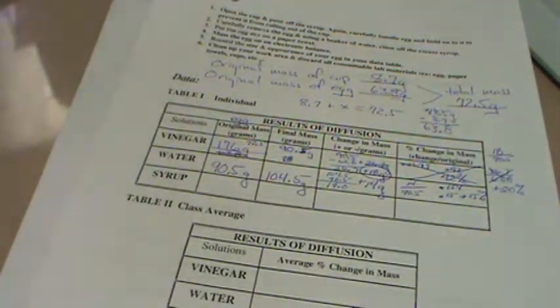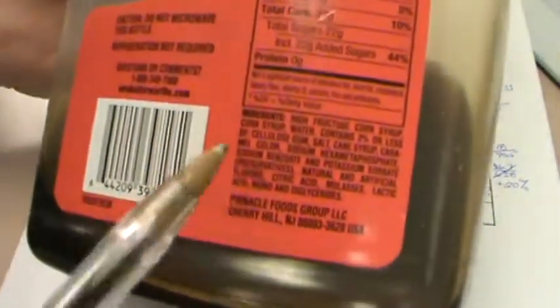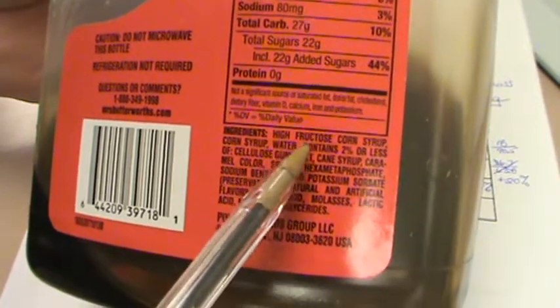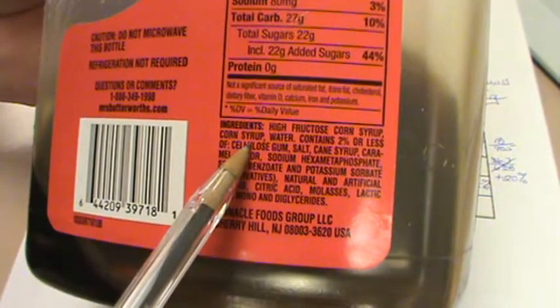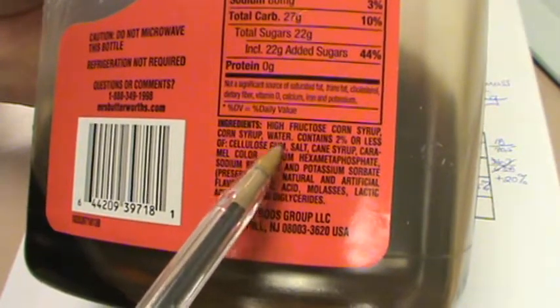We're up to 104.5. Now the next part asks us to put syrup in, and in a lot of them it says Karo syrup. We're going to use just good old-fashioned Mrs. Butterworth's, and the first ingredient in Mrs. Butterworth's is high fructose corn syrup, which is the same as Karo syrup, or Karo syrup traditionally was just a corn syrup. So the third ingredient in here is water.